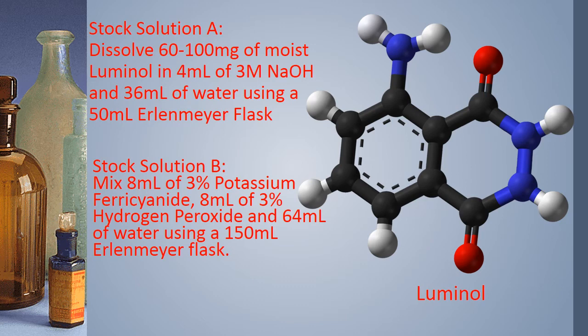For stock solution B, we mix 8 milliliters of 3% potassium ferricyanide, 8 milliliters of 3% hydrogen peroxide, and 64 milliliters of water using a 150 milliliter Erlenmeyer flask.